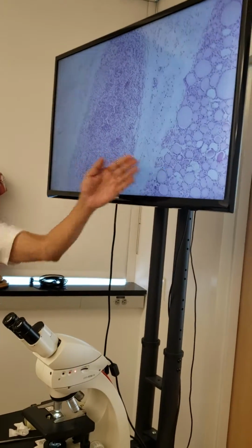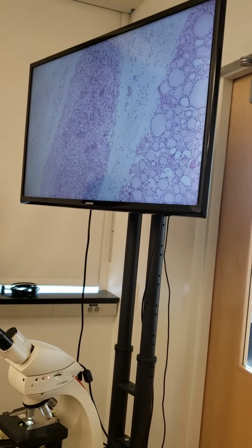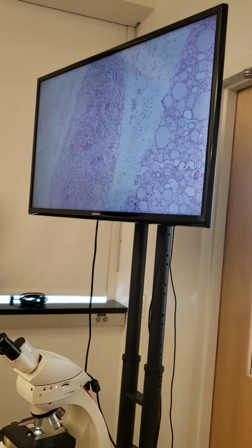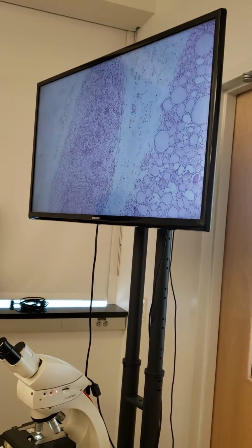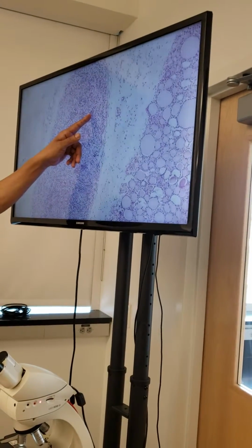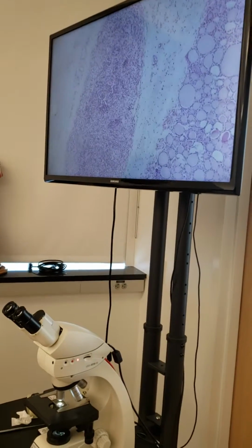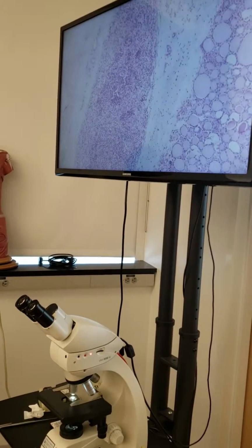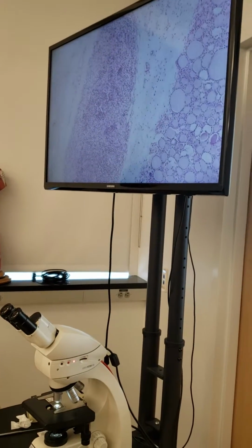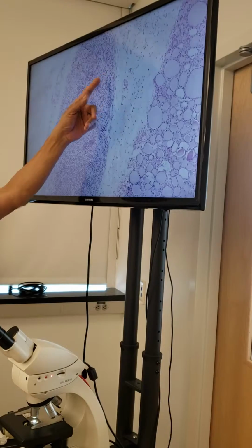See the difference here? In the parathyroid, how many types of cells do you have? Two. Chief cells and Oxyphil. The chief cells are the ones which look darker. Oxyphil cells are the ones which look lighter. All slides may not show like this. Also, every cell may be dark. So it just depends. By chance, in this slide, you can see easily, right? Dark cells and the light cells, right?